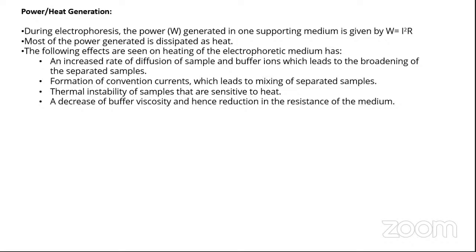We expect that the resistance should decrease because of decrease in the viscosity of the medium with increase in temperature. But as soon as the temperature increases, this heat generation also leads to evaporation of the medium, the solvent of the medium. What that does is that it increases the concentration of buffer ions.